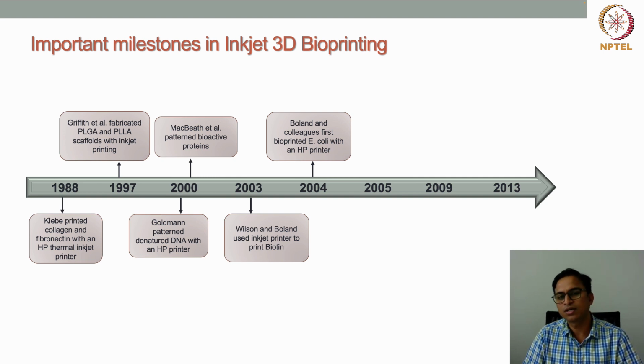They found that after printing, the organism was still alive, so this printing technology doesn't cause any damage to the organism.